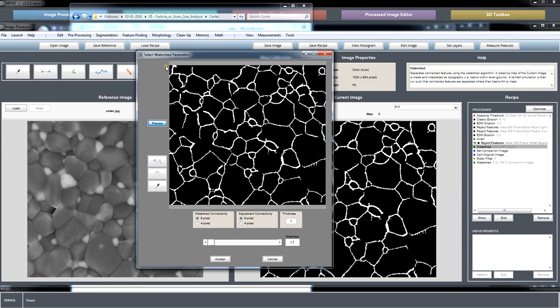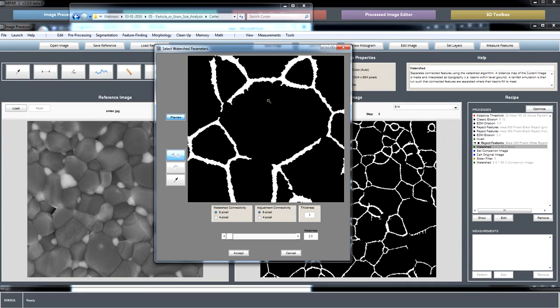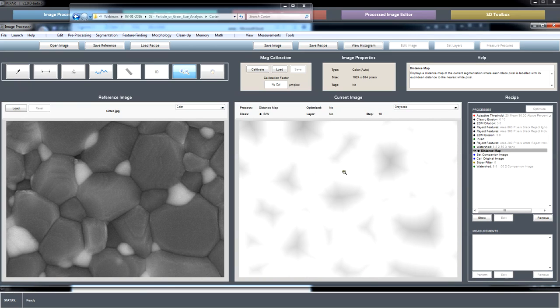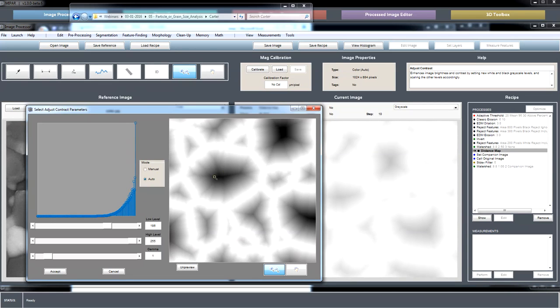What this is doing roughly is it's considering a distance map of your binary image where every black pixel gets labeled according to the distance to the nearest white pixel. If you want to see what that looks like real quickly, can't promise that it won't throw an error here, but oh, it's fine. Okay, so this is the distance map here. If I scale up the contrast so you can see it, your binary image turns into this in the background. So you get very intense values that indicate these pixels are furthest from the nearest white pixel.